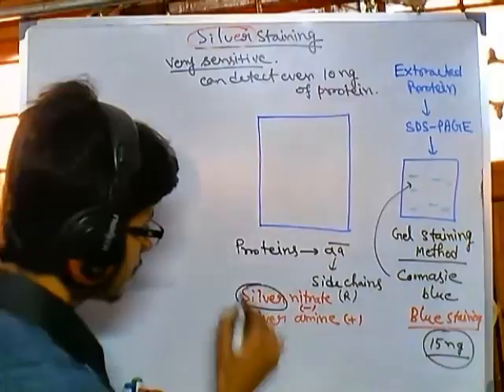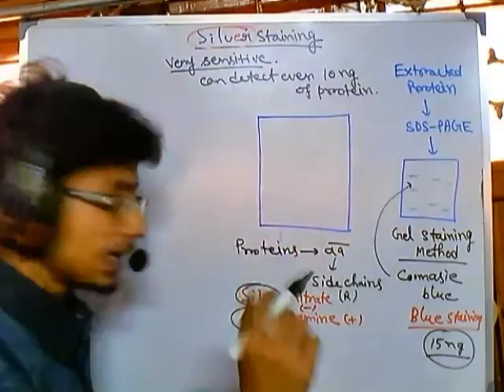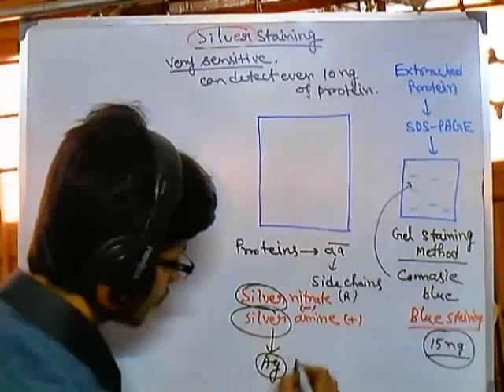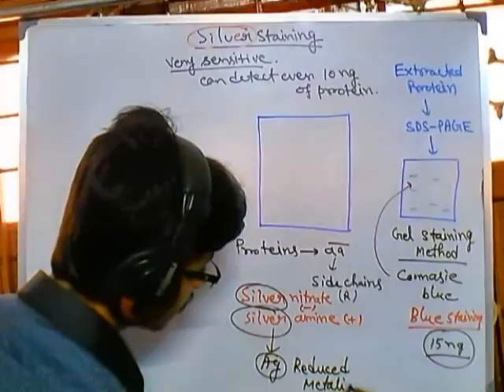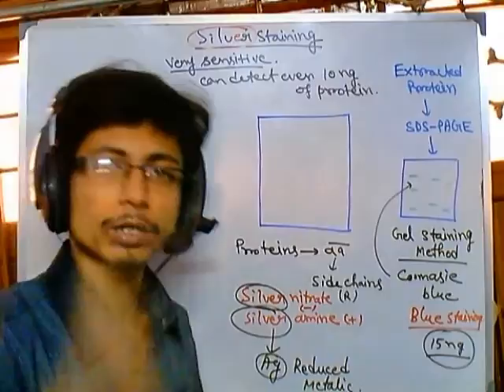So what can the silver do? When silver nitrate or silver amine interacts with the side chains of the proteins present in this gel, it is reduced into metallic silver, or free silver. As the silver nitrate or silver amine is reduced, it forms metallic silver, which will be deposited onto the protein content. So deposition is done.